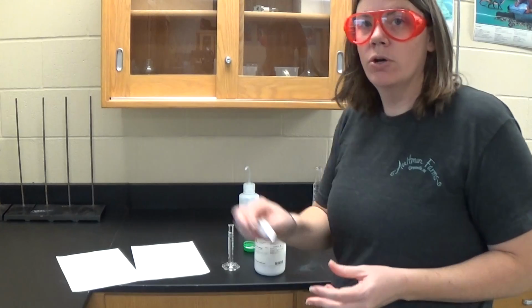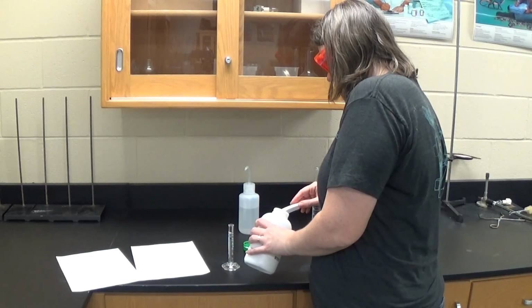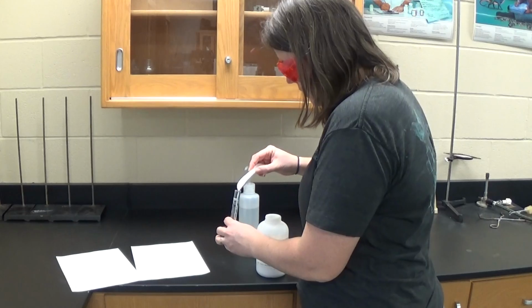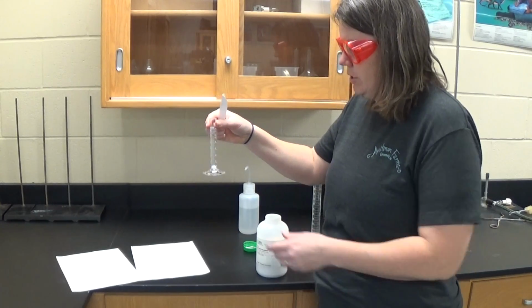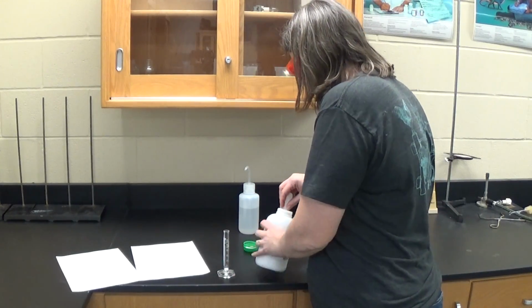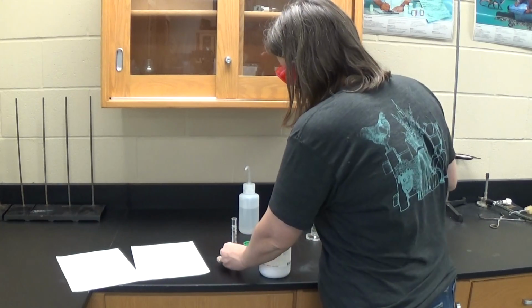So because it says small scoops, I'm going to make sure to use the back side instead of the front side, and shake a little out there. And so there's enough for 2. As you can see, that is not very much at all. Actually, let's go ahead and add just a smidge more. So there is enough for 2 small scoops.